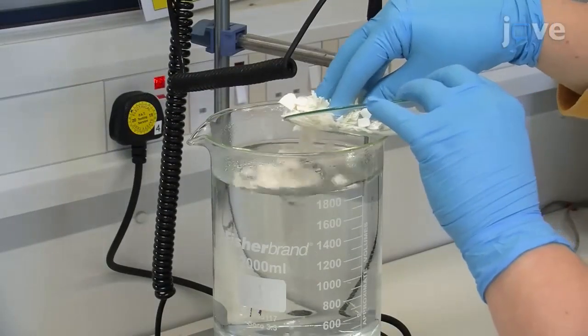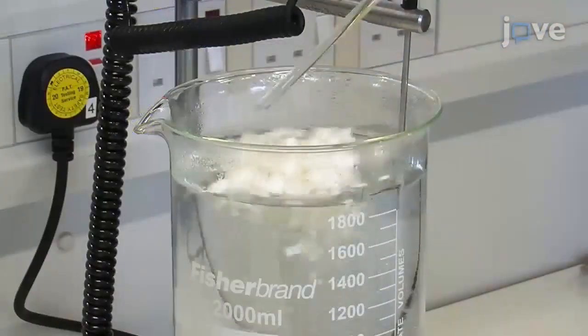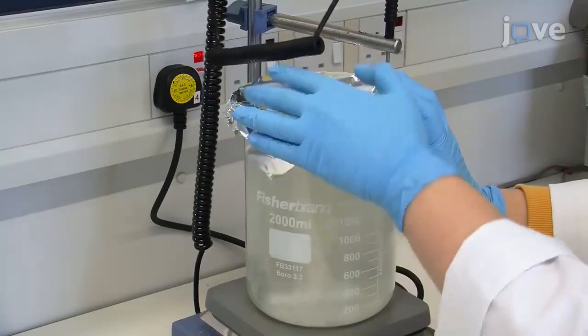Once the solution starts to boil again, add the cut pieces of the silk cocoons to the solution. Ensure that all the silk is submerged and heat the solution with constant stirring for 90 minutes. Cover the beaker with aluminum foil.